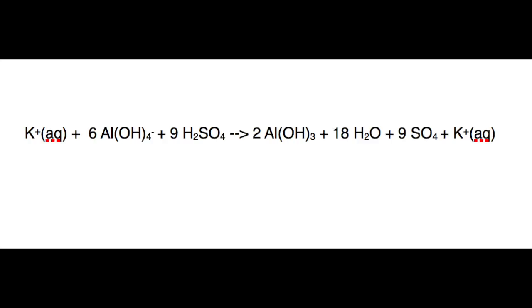Impurities in the tinted foil precipitated out of the solution in the form of a dark magnetic solid. Much of the solid particulates stuck to the magnetic stir bar as the reaction proceeded towards completion. In order to separate all the solid precipitate from the aluminum and potassium solution, the solution was filtered through a filter paper and a Buchner funnel attached to a vacuum pump.